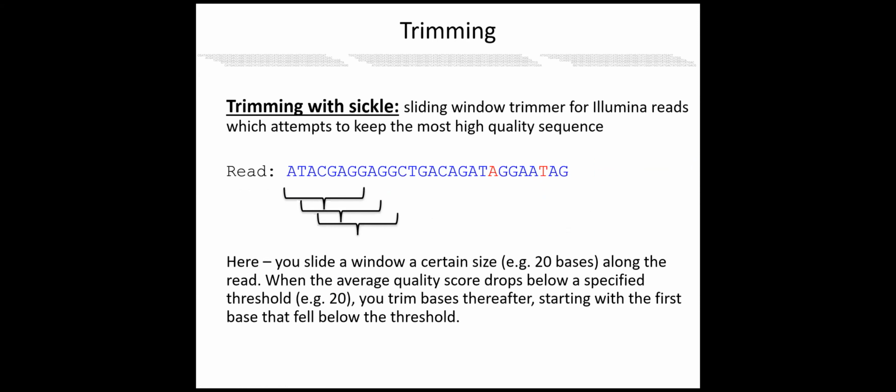So quickly, I have a question from the audience. Do you have to input your adapter sequence? Yes, you have to explicitly tell Scythe what your adapters are, and we'll be doing just that in a moment. I'll show you how to do that.